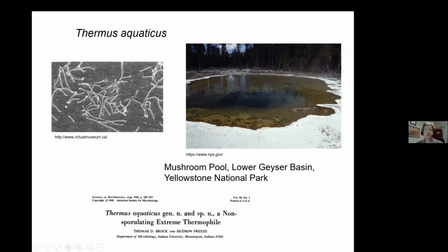All right, so this is what we call Taq. So if you see the term Taq polymerase, that just means DNA polymerase, the enzyme that copies DNA from Thermus aquaticus. So they took the T and the AQ and they pushed them together. That's Taq. So we now had an enzyme that you could heat up to 95 degrees and it wouldn't fall apart. It would stay active.